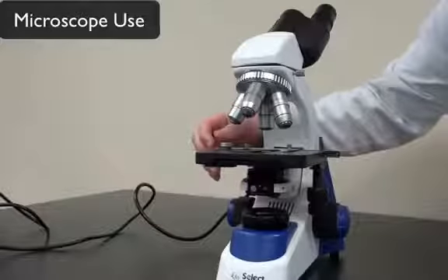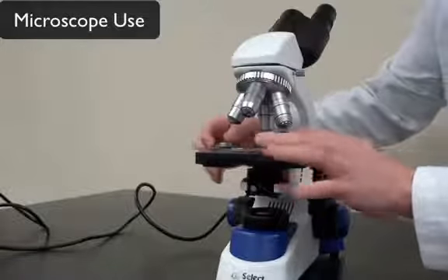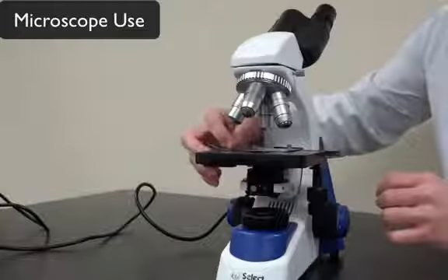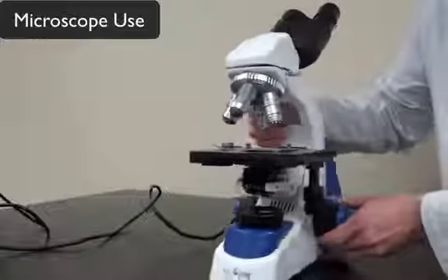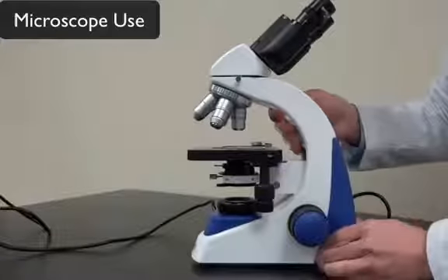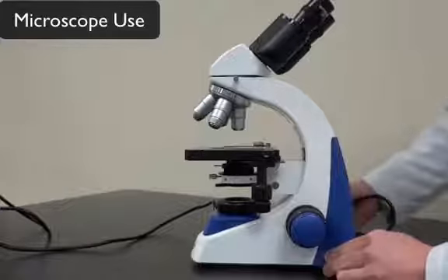You can see the little stage clips here. You're going to just set the slide on here and carefully place the slide, and the little stage clip is going to clip it in and hold it into place. Okay. So now that the stage has the microscope slide and the specimen we're going to look at, we can turn on our light source.